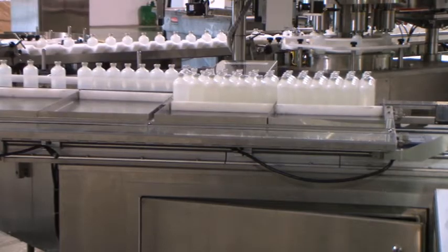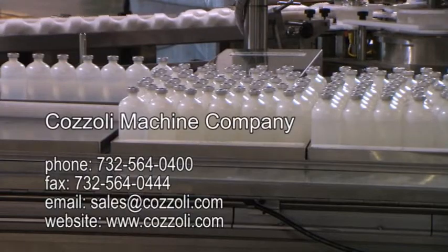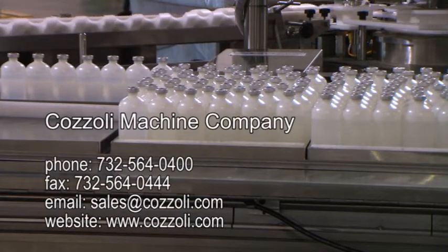The Cozzoli Machine Company's high-performance liquid filling line was produced with the same quality and service that Cozzoli Machine Company has provided for over 90 years. Please contact us for more information about our products and capabilities.